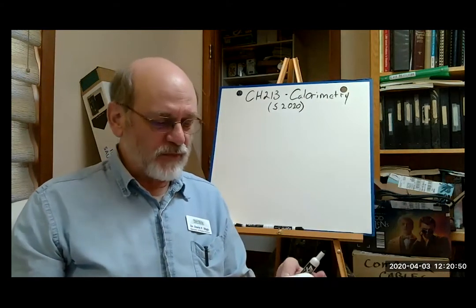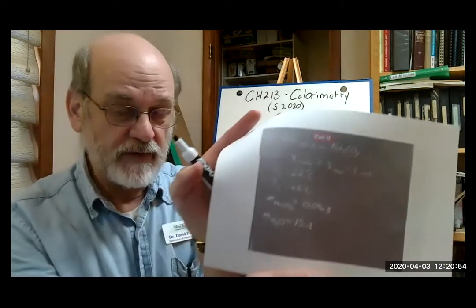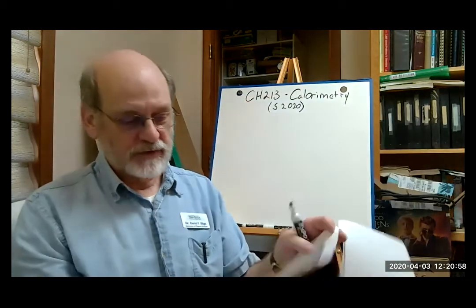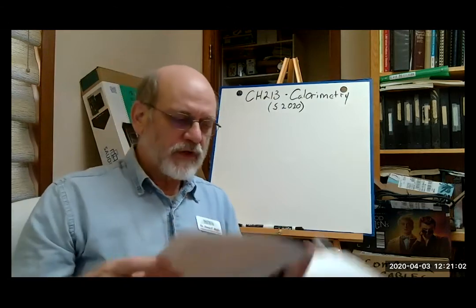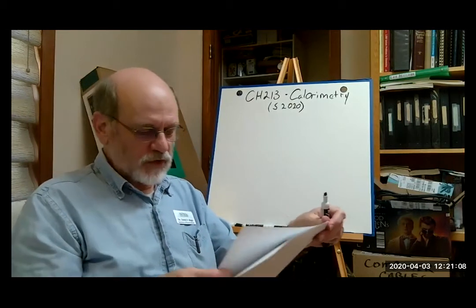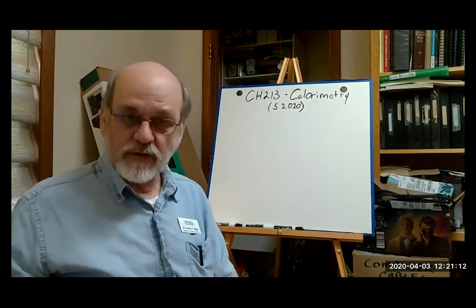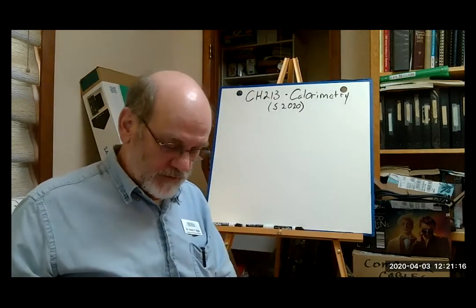But for the last two, parts 2 and 3, I only give you the raw data, because by this time you should be able to do the experiment yourself. Now, what do you do in part 1 when you're trying to express your values so that they can be compared to the accepted values?